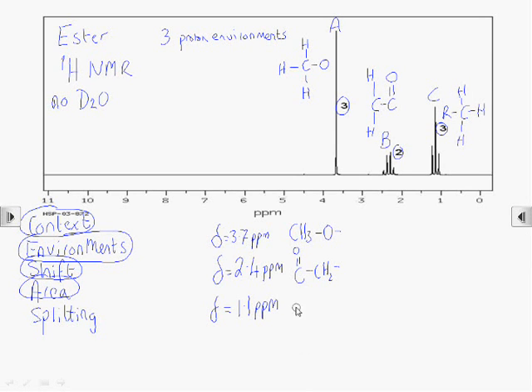So we've got a list of all the fragments of our molecule. And it's now a question of piecing those together. And that's where the splitting helps, because it tells us the sequence of the pieces.